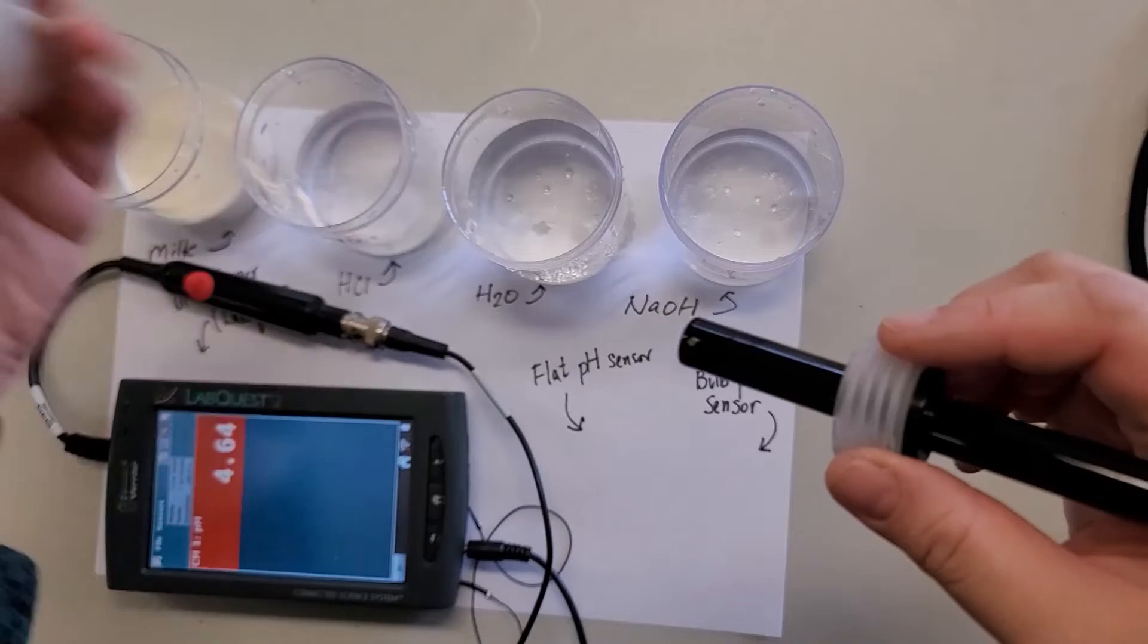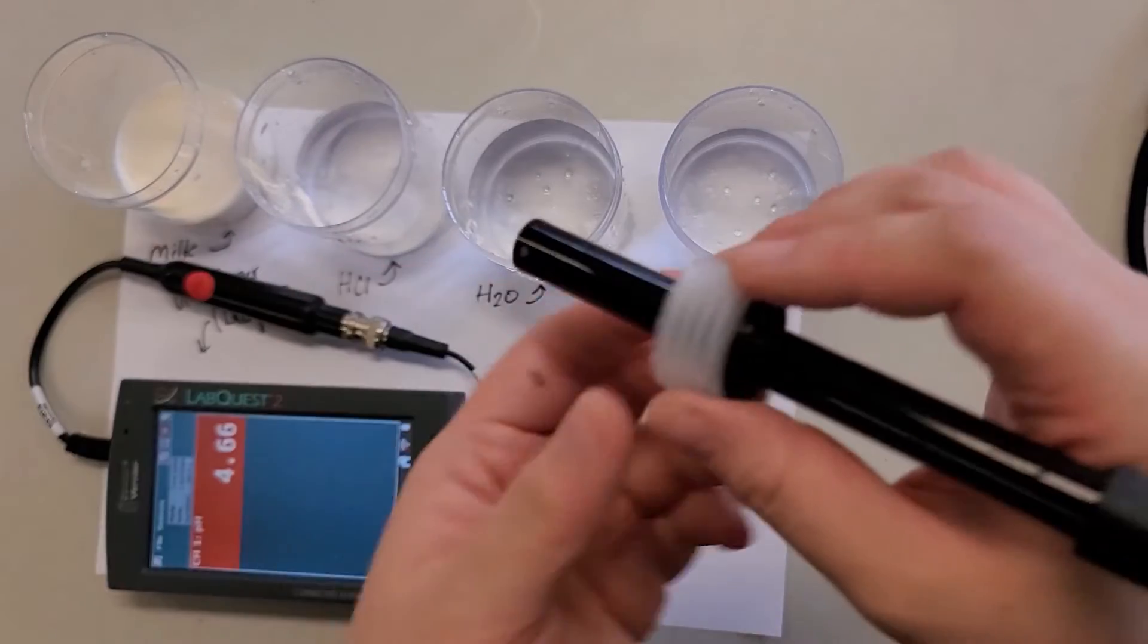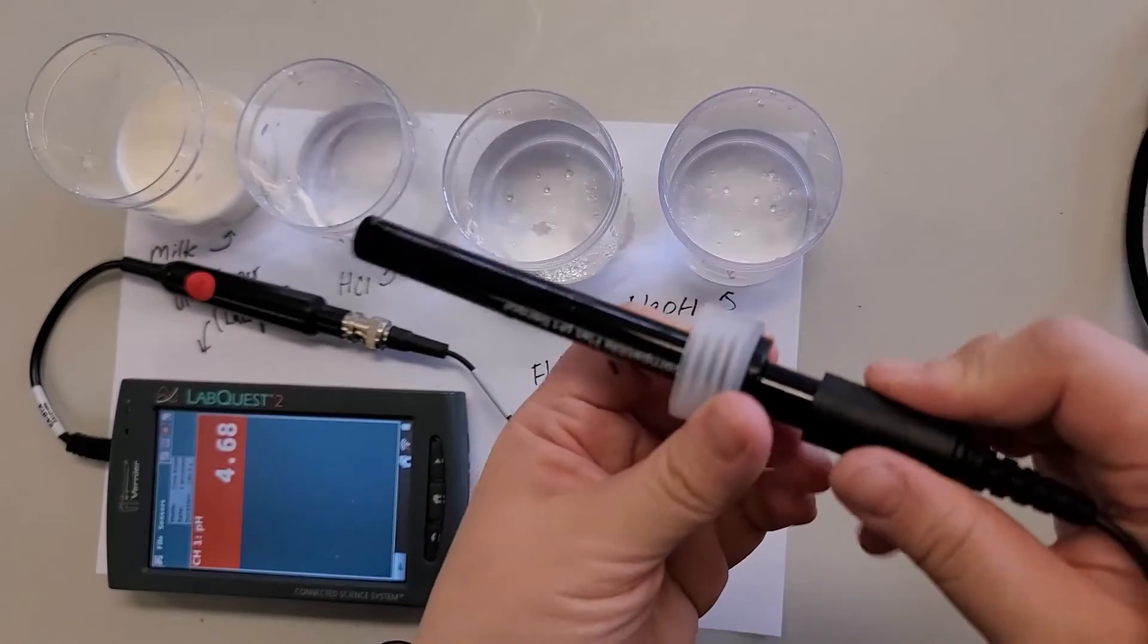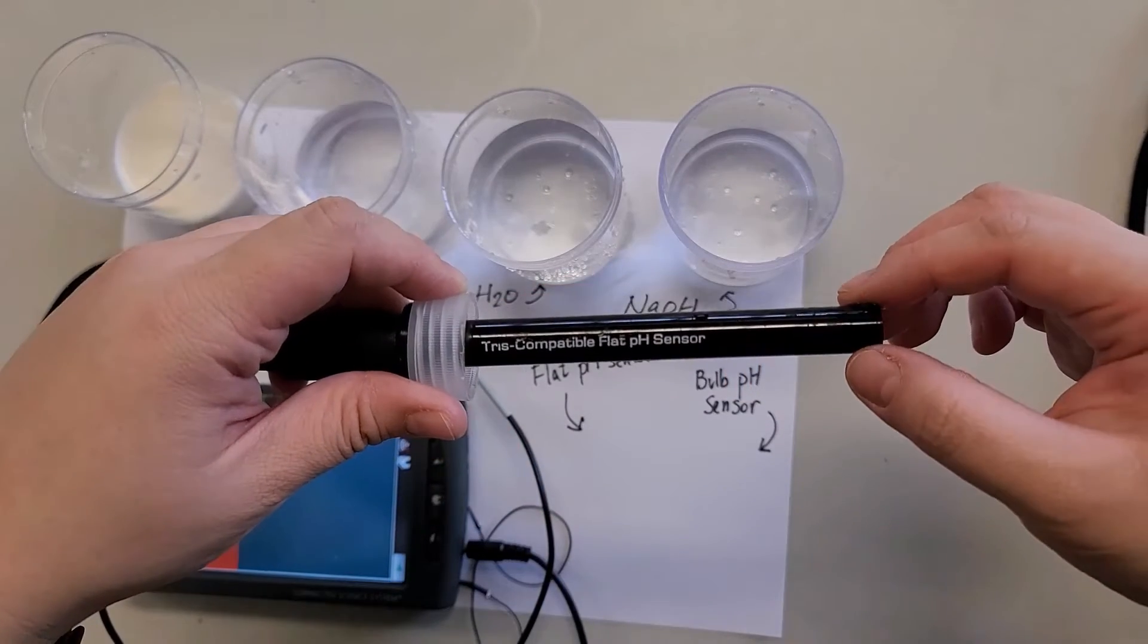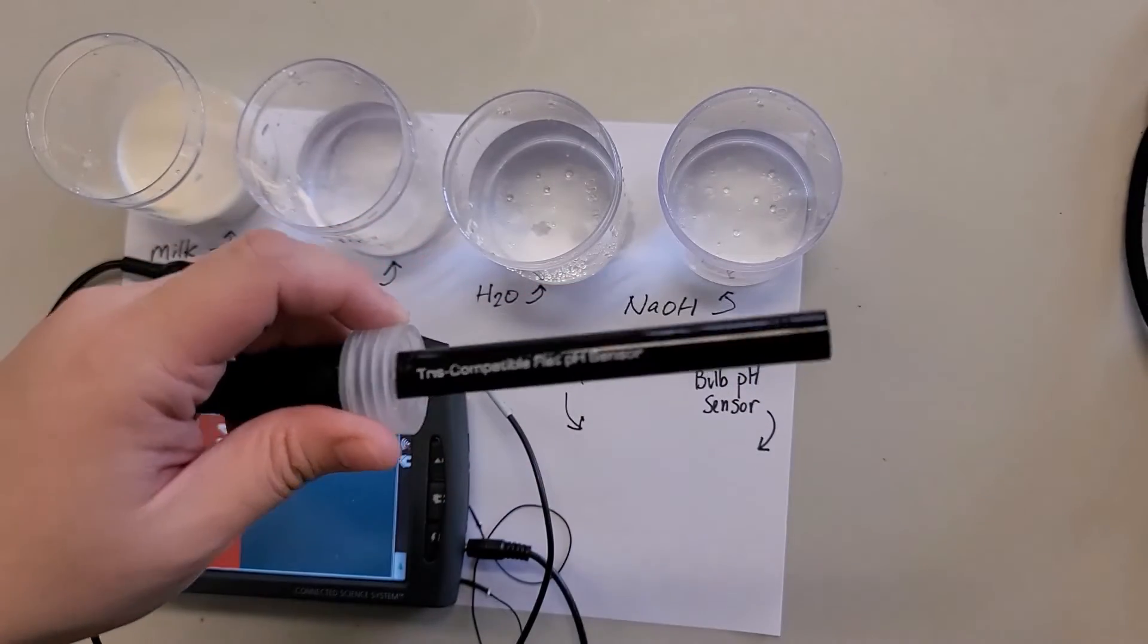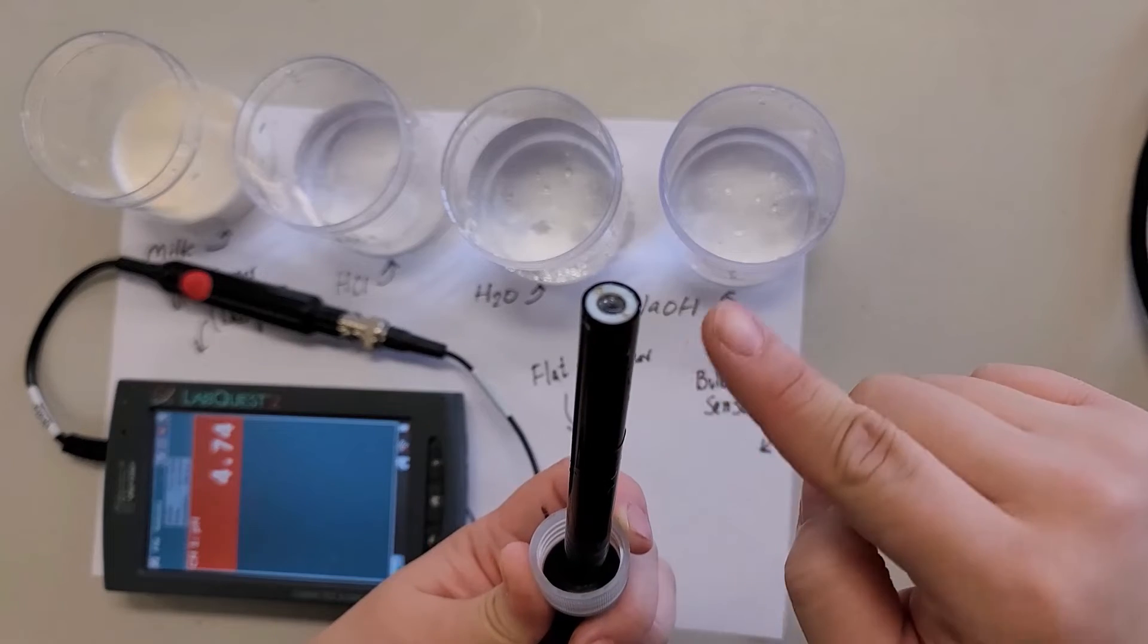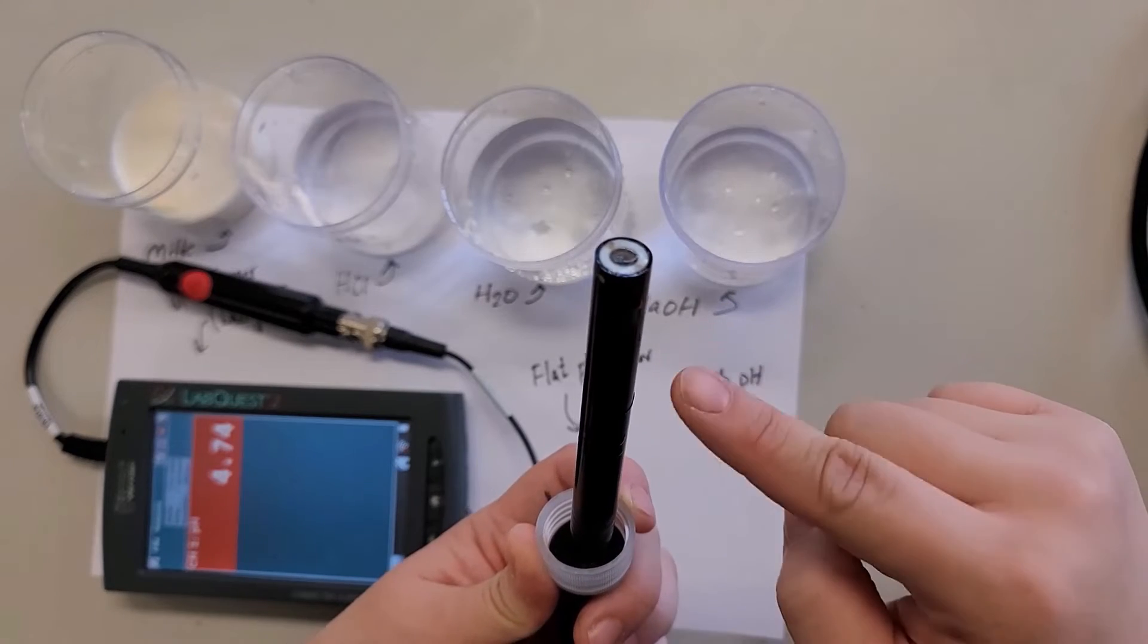Make sure the sensor is always inside the buffer solution when not used. So now this one, as you can see here, this is the flat pH sensor. You can see that there's a very thin membrane at the top. It's very important that we keep it moist.